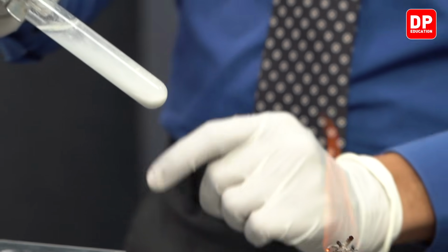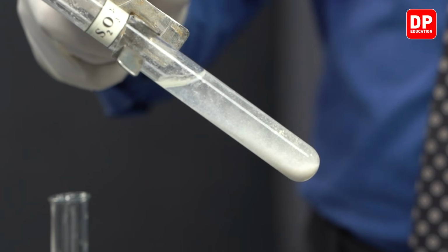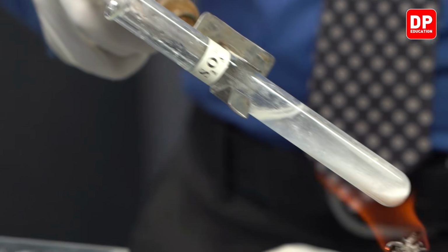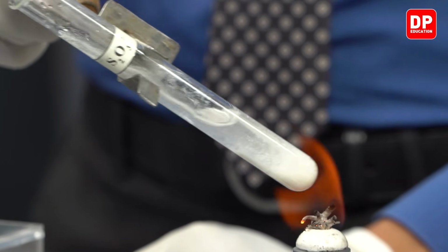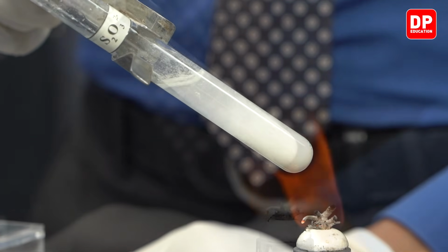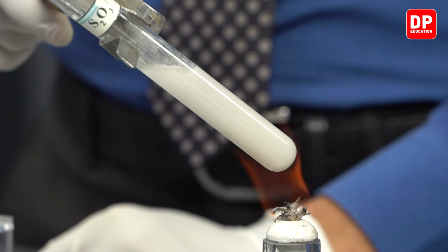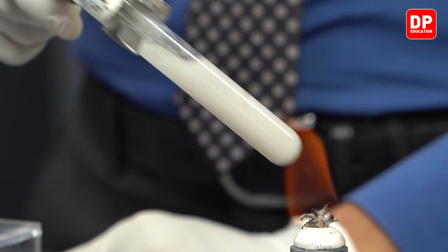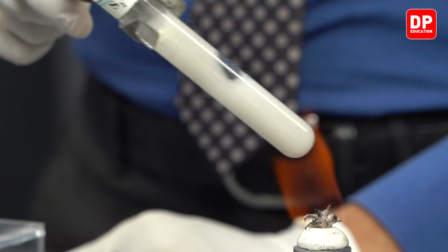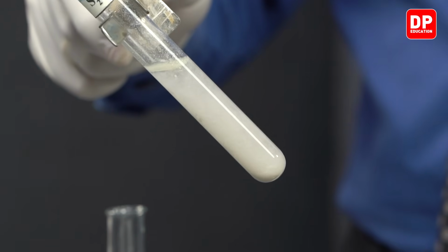We can clearly see the white color of the precipitate is decreasing little by little. It is now a little bit of a grayish color. Now you can observe the precipitate is a bit of a darker gray color. It is no longer white.